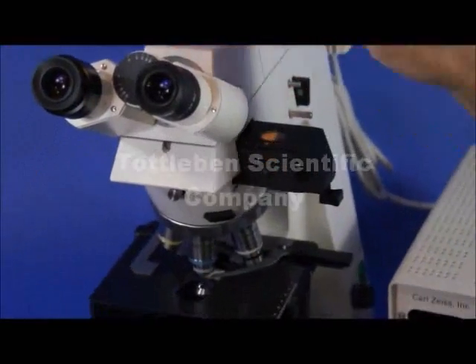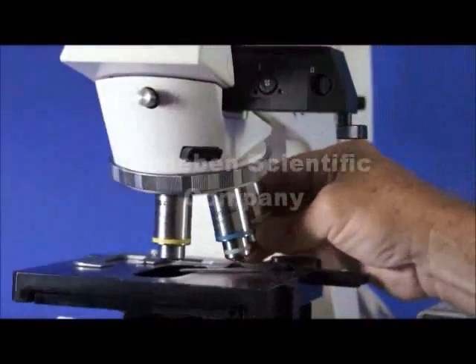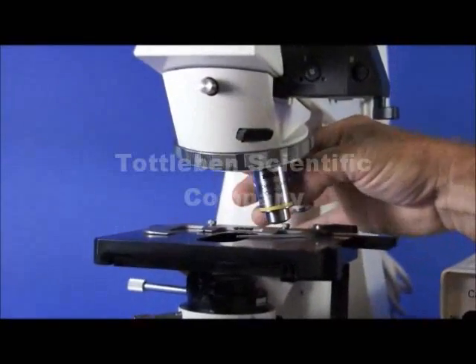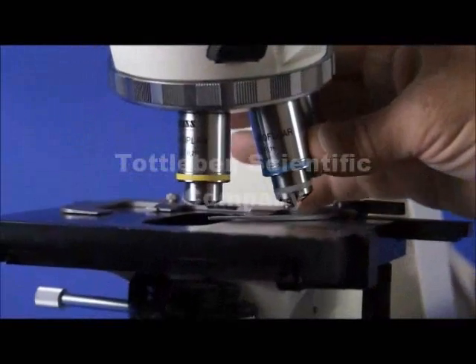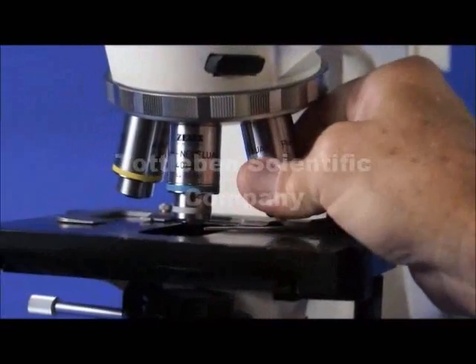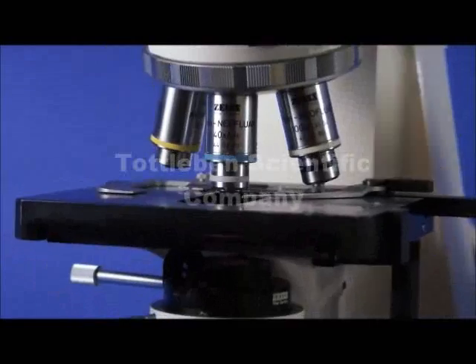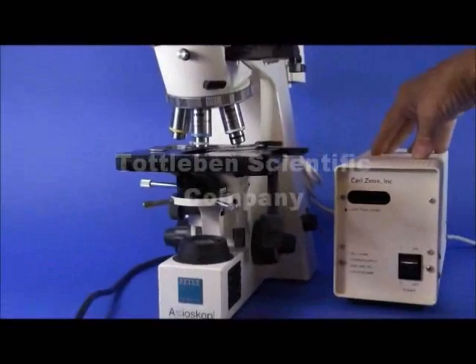Moving right on down, we have the nosepiece, which is a 6-place nosepiece. Most nosepieces are 5-place; this is a 6-place and it's equipped with a couple of very nice lenses. You've got a 10X Acroplan, which is a plan achromat, and you have Plan-Neofluar lenses, which are the state-of-the-art lenses for Zeiss. They're especially useful for fluorescence microscopy, and this microscope has a complete 50-watt HBO mercury light source.